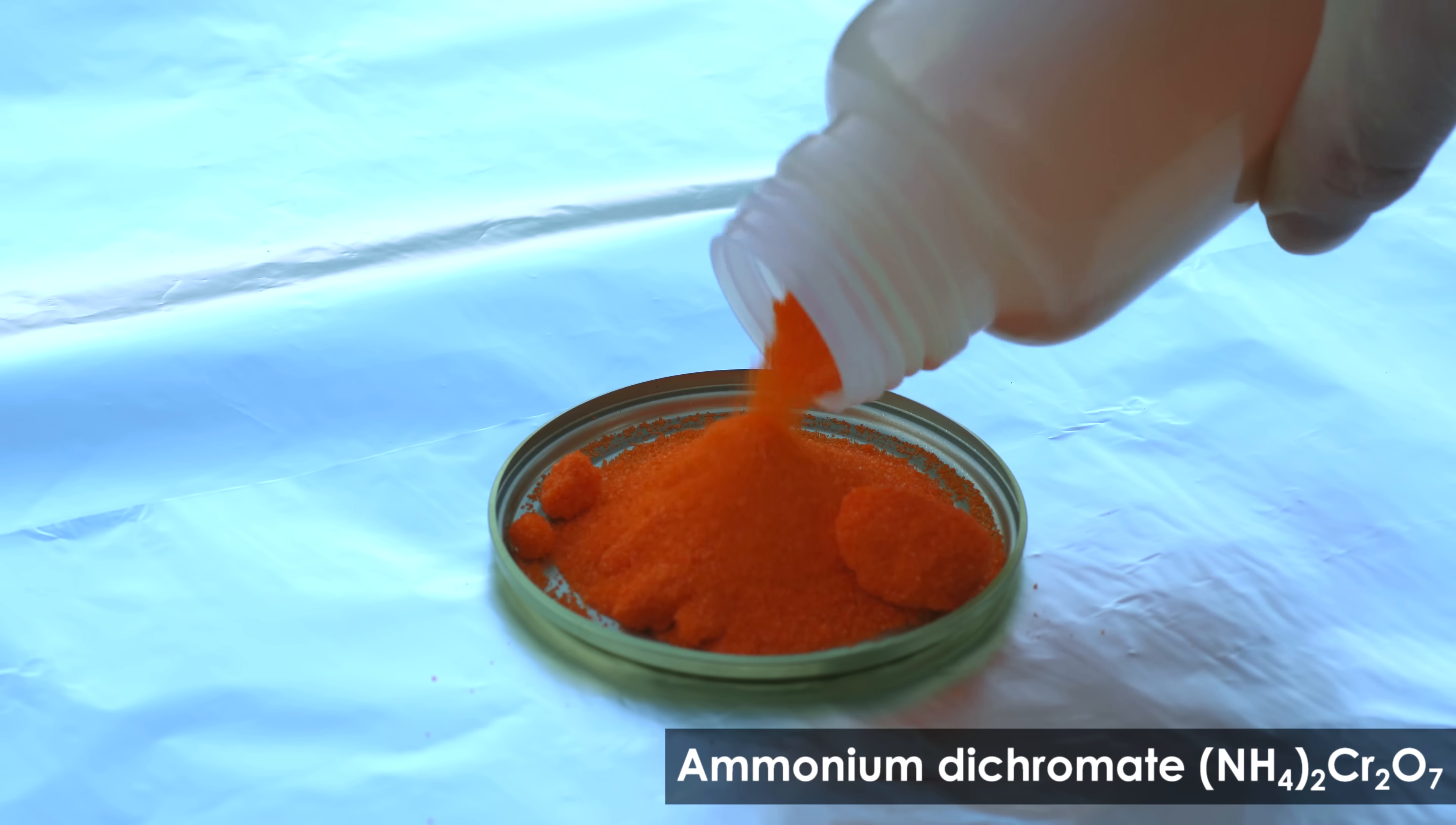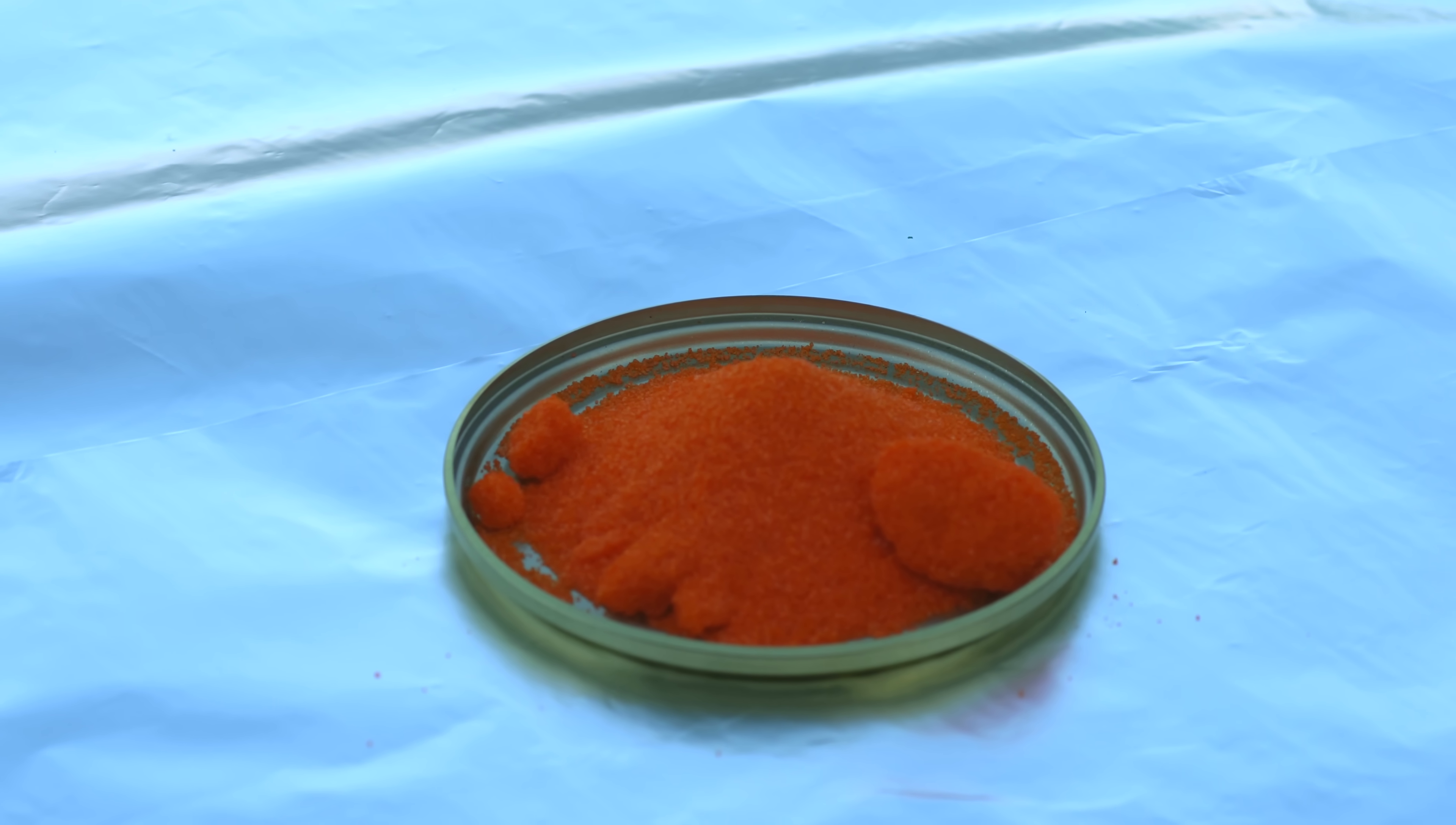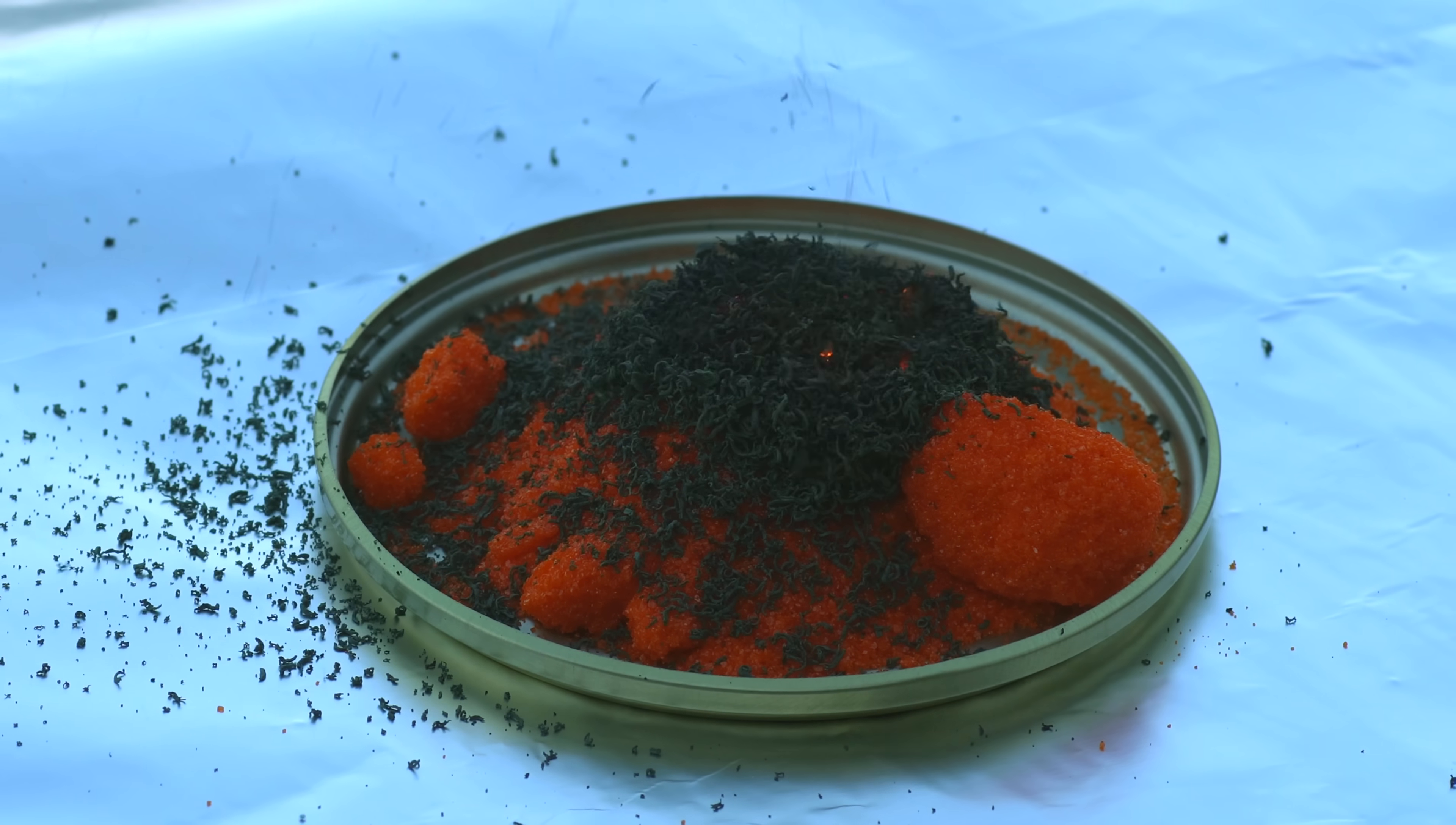In order to do it, let's take another orange chromium compound, ammonium dichromate, in which chromium also has an oxidation state of plus 6. Now, I'm igniting this orange powder, and what do we see?